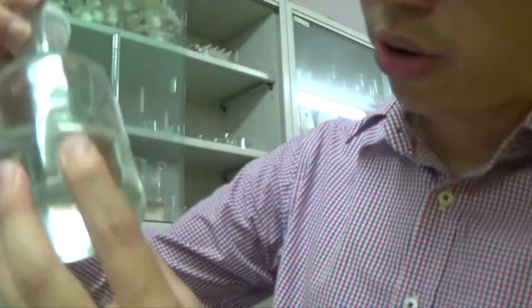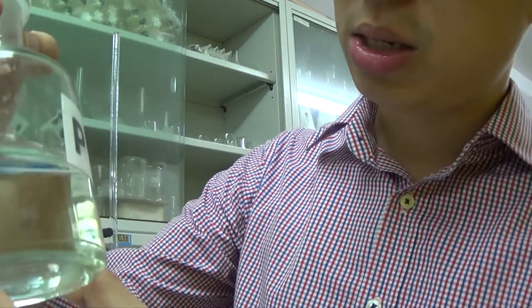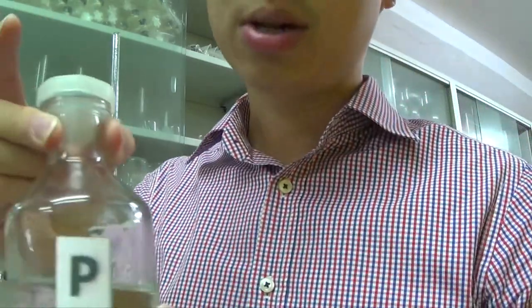The iron(II) is a very faint, pale green solution. It's dissolved in sulfuric acid because sulfuric acid helps to prevent the oxidation of iron(II) to iron(III) in the presence of oxygen.